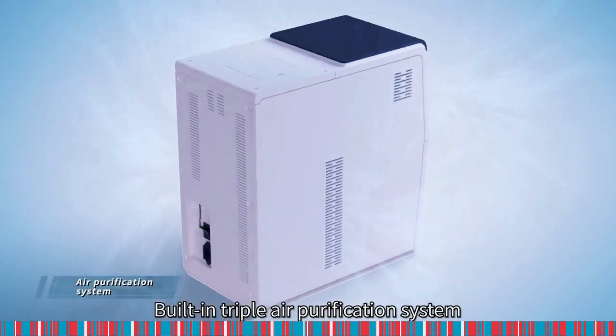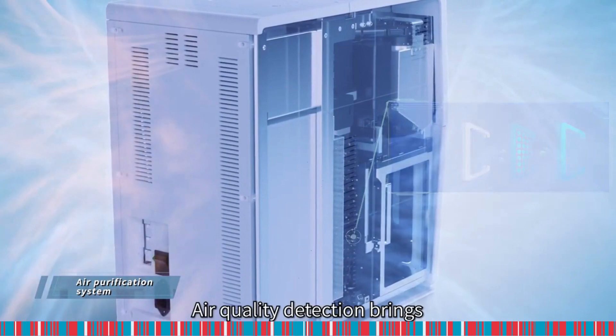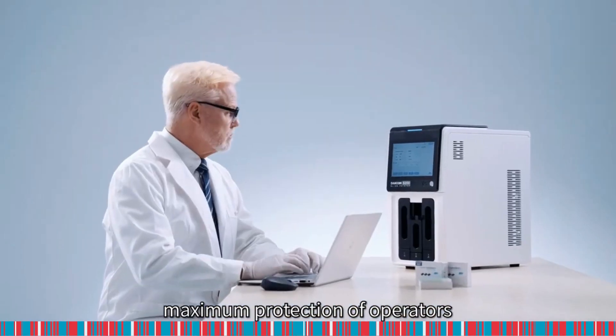A built-in triple air purification system filters hazardous particles and odors. Air quality detection brings maximum protection of operators.